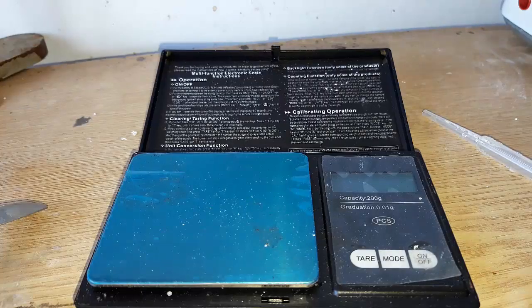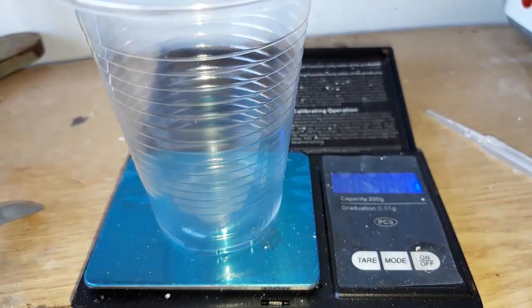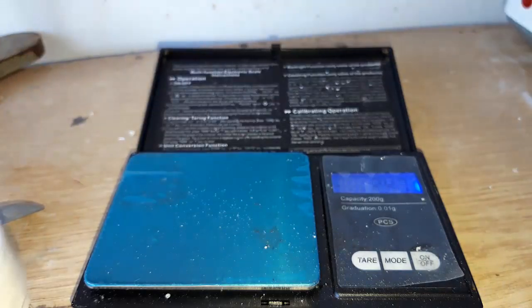We got about 8.9 grams of a pure product, which is a 45% yield. I think we lost a lot of our product in the recrystallization step.